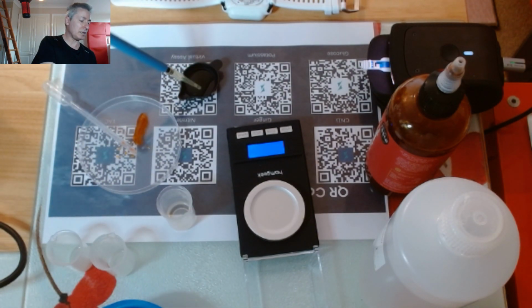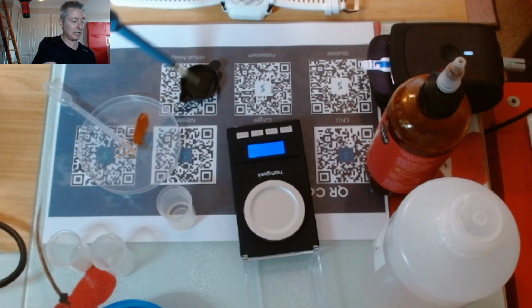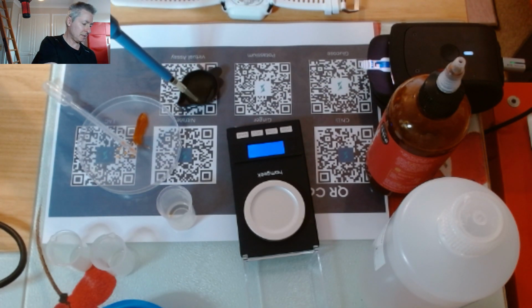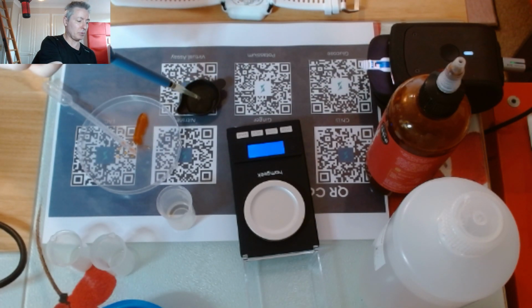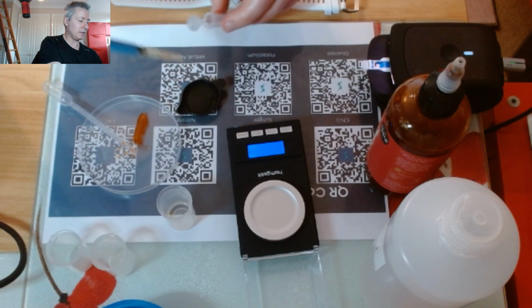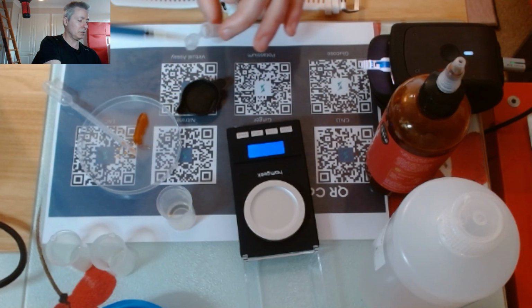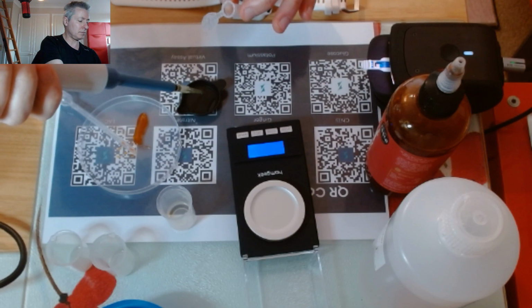I do have a vortexer in front of me. There's nothing fancy about this vortexer. It's just a vortexer that you can get on eBay. Obviously, depending on the sample, you can have a different sample prep, but this sample is quite viscous, but we are able to extract the material.